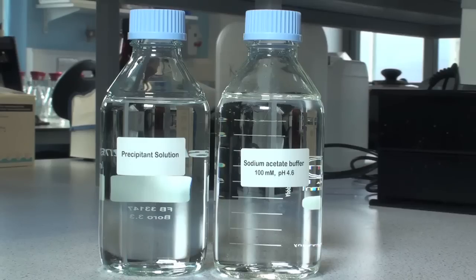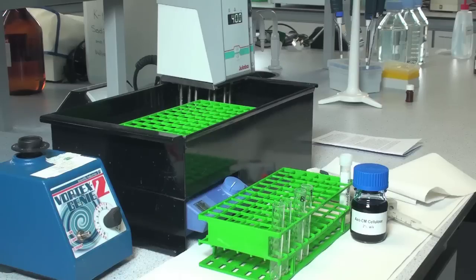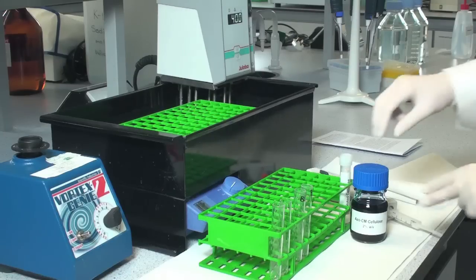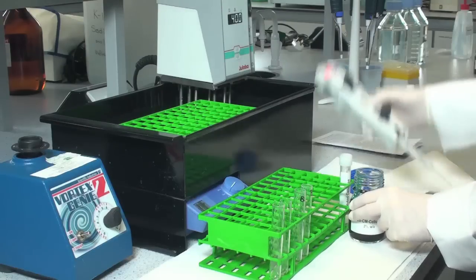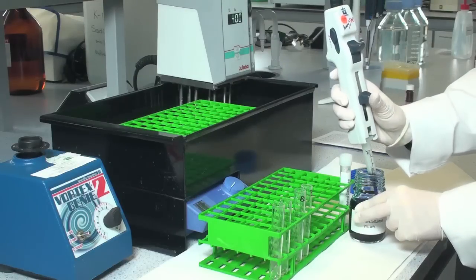Prepare the 100 millimolar sodium acetate buffer pH 4.6 as described in the manual. Add 0.5 ml of substrate solution to each of 4 tubes, 2 for the sample and 2 for the blank.